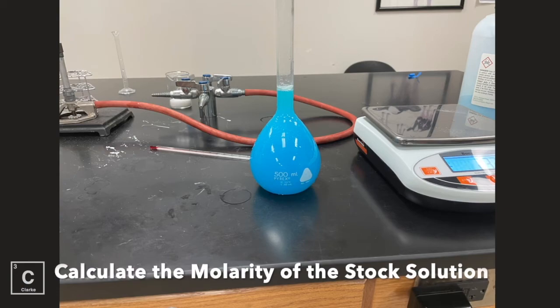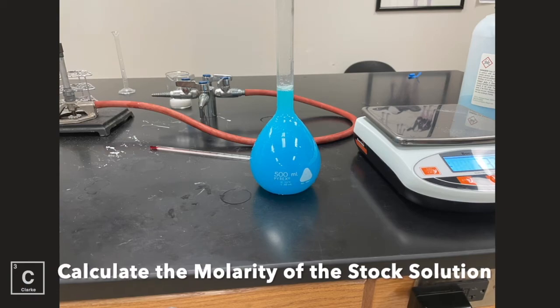And here's our solution. Now remember, we're calling this the stock solution. Get ready for the dilution.